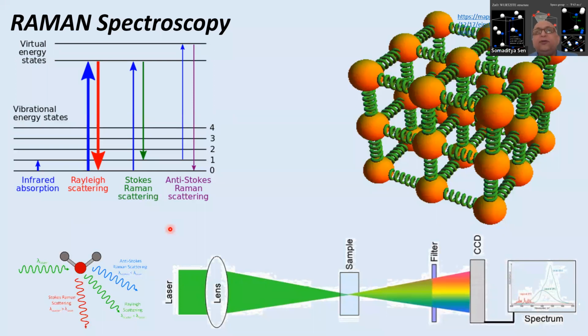First of all, Raman spectroscopy is a very interesting thing, but it requires a lattice to vibrate. If the material that you are investigating is not in a regular crystalline lattice, then it is difficult to get a Raman spectrum. Although it is used to find out some crystallographic components in the forensic elements. But it's not guaranteed that you will find a Raman spectrum from all materials. It's very difficult.